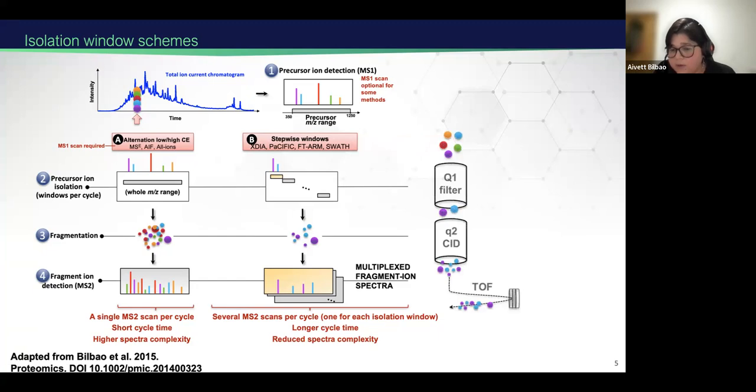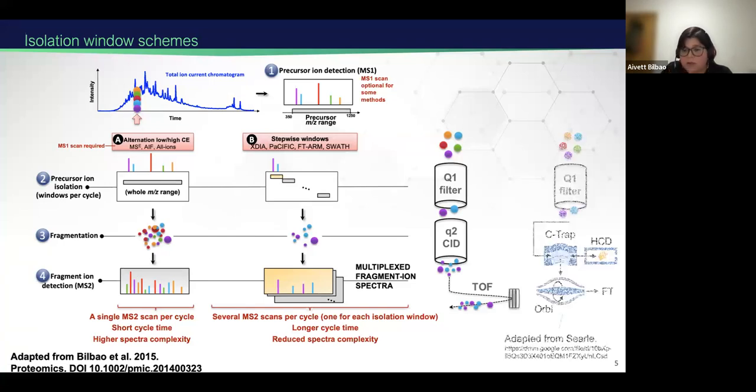And in terms of instrumentation, there are time-of-flight and quadrupole time-of-flight instruments to do this kind of analysis, or also Orbitrap platforms. If we have the quadrupole, we can do this kind of SWATH. So the difference is then that it's an Orbitrap mass analyzer.